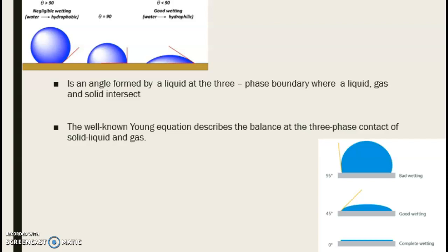Contact angle has been an important parameter to determine the wetting ability of the polymer membrane surface. Contact angle has gained interest in surface science in regards to its fundamental aspects and application point of view.